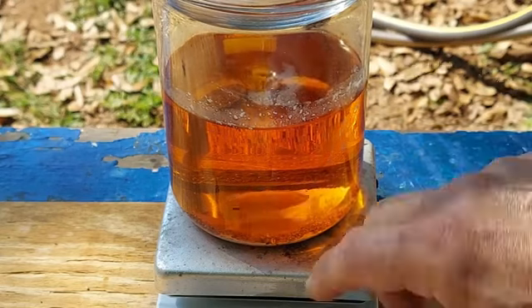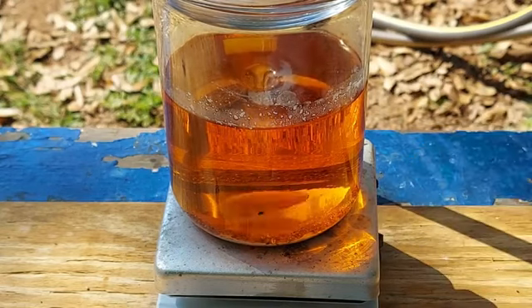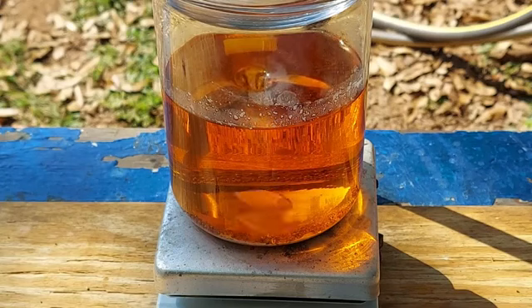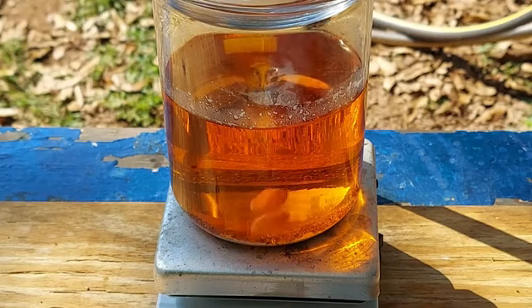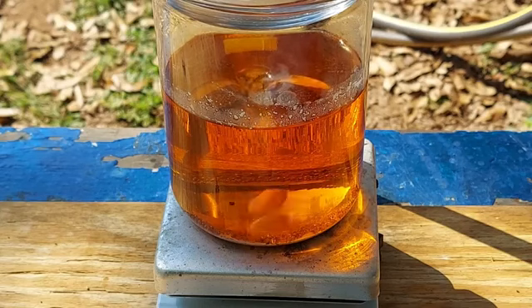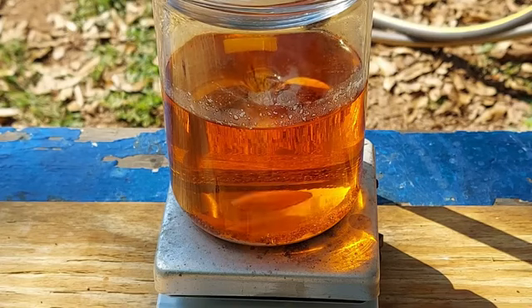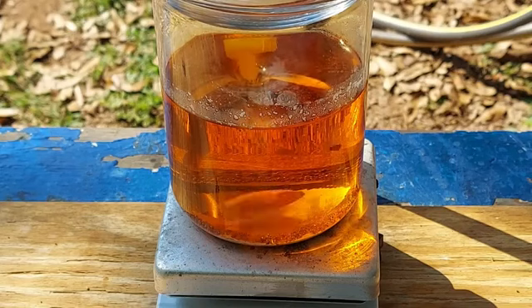So as it's warmed up, some of the bromine has gone into solution, which is why it's turned this nice amber color. And the solution is completely clarified as predicted. All of the mercurous salt has been oxidized to mercuric salt. And I made another video a long time ago thinking that this was a viable way to make mercuric bromochloride. But I think what it really ends up being in the end is either going to be mercuric bromide or more likely just mercuric chloride. I don't know what happens to the bromine.